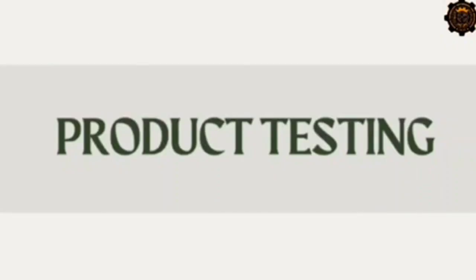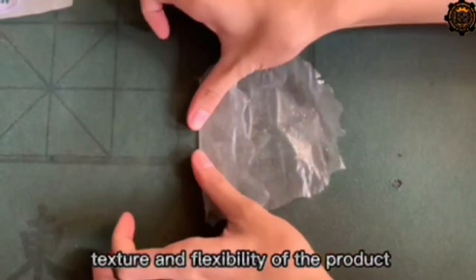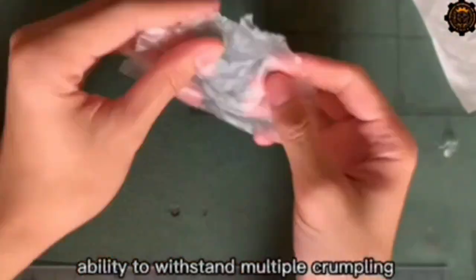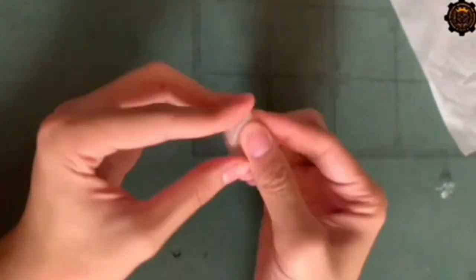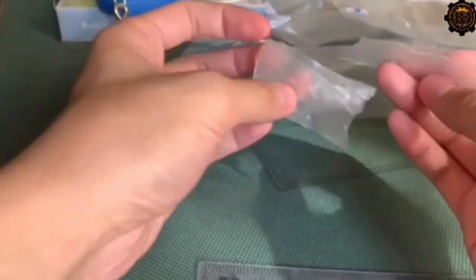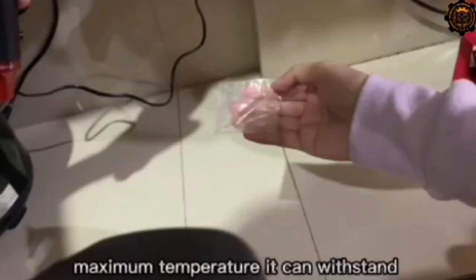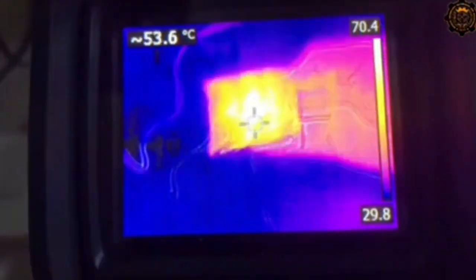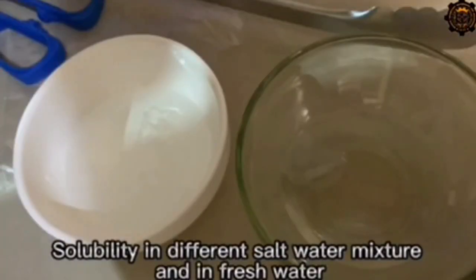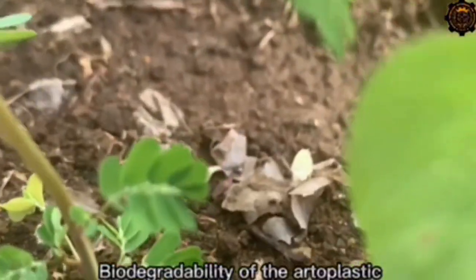Once dry, the researchers conducted a series of tests: texture and flexibility of the product, total length it can expand when stretched without ripping, crumpling, ability to resist tearing at three different levels, weight that the bioplastic can withstand while attached to a crane scale, the maximum temperature it can withstand, solubility in different saltwater mixtures, and the amount of time needed for the bioplastic to totally decompose naturally.